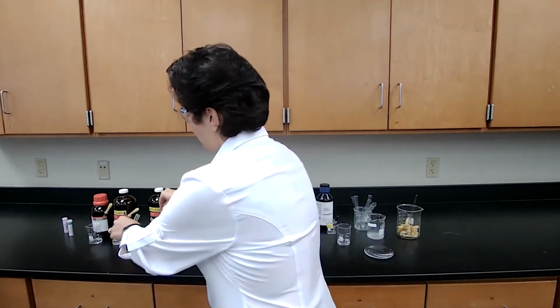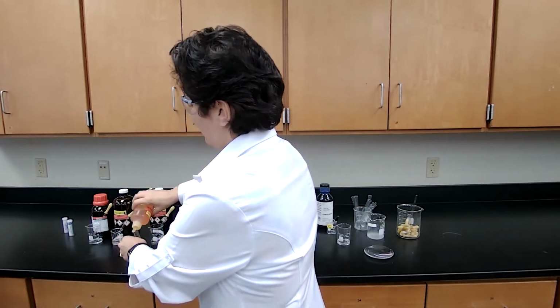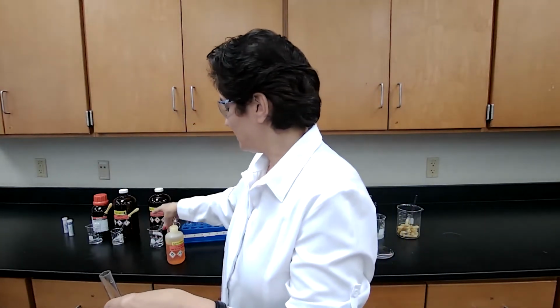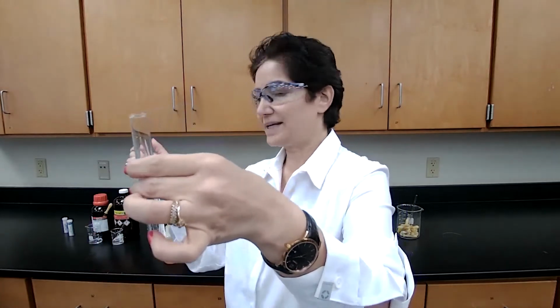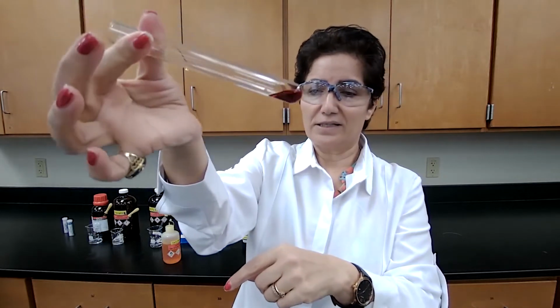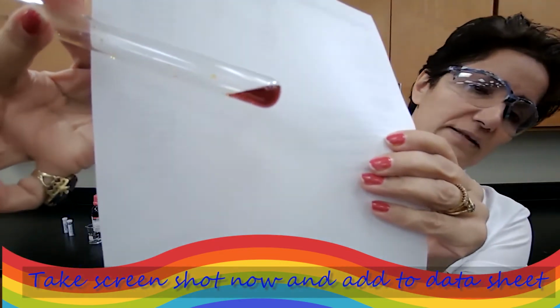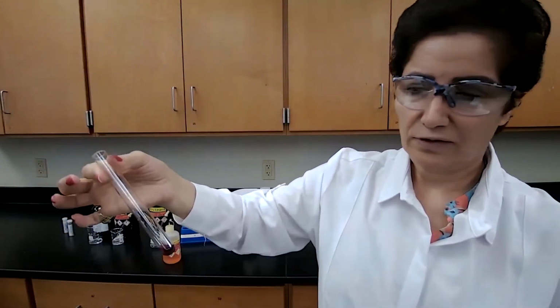The first compound I'm testing is ethanol. So I add 3 drops of ethanol, and then I add the ceric nitrate. Ethanol was a clear solution. My ceric nitrate is a dark yellow color, and in the test tube for hexane you will see that it's actually a light yellow color. And when I add ceric nitrate to the alcohol, it turns a dark red color. So that's the positive test for alcohol.